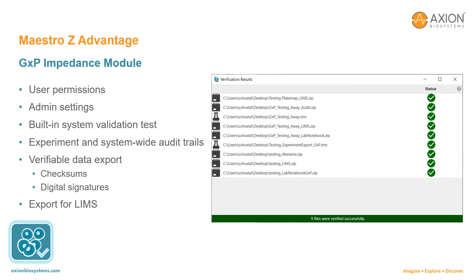The new GXP impedance module has compliance features enabled so that you can achieve FDA 21 CFR Part 11 compliance in GMP and GLP labs. User permissions ensure access to experiments and settings is controlled according to your lab's preferences. A built-in Maestro hardware test ensures impedance measurements are accurate in every experiment. Experiment and system-wide audit trails track who ran each experiment, the changes that were made, and preserve all original data.